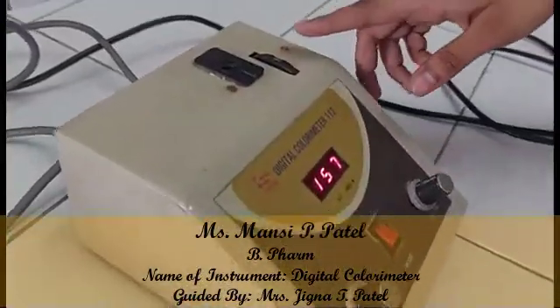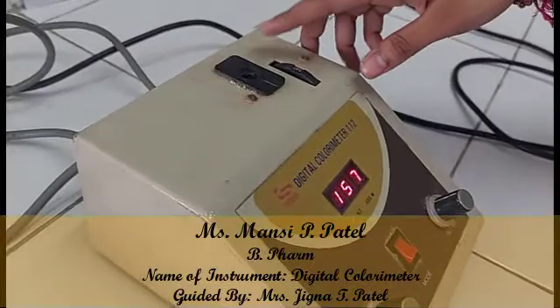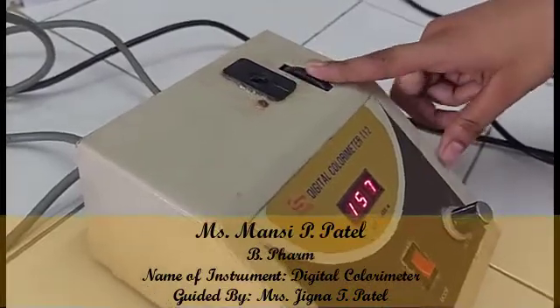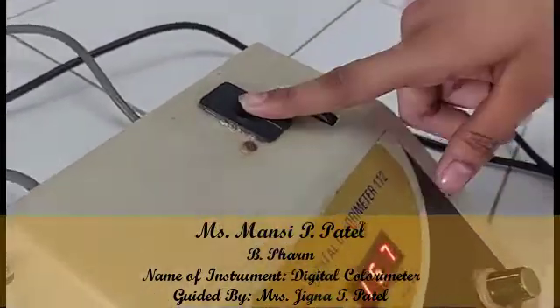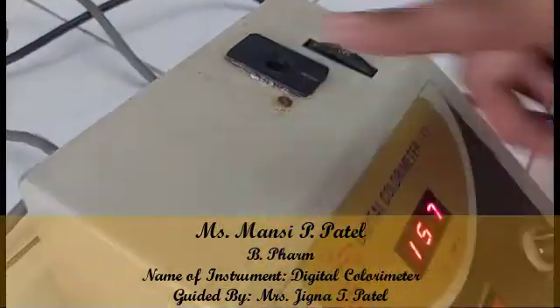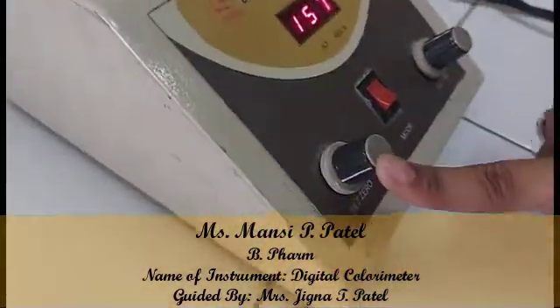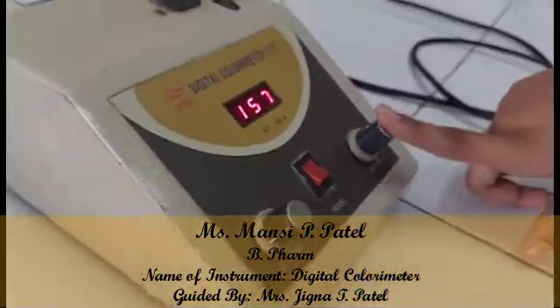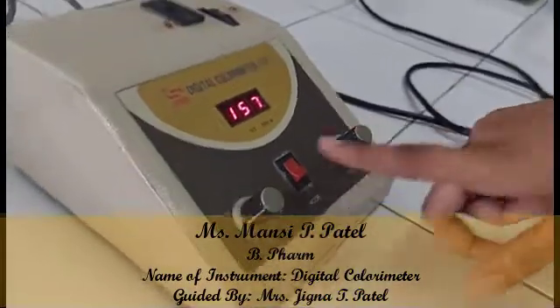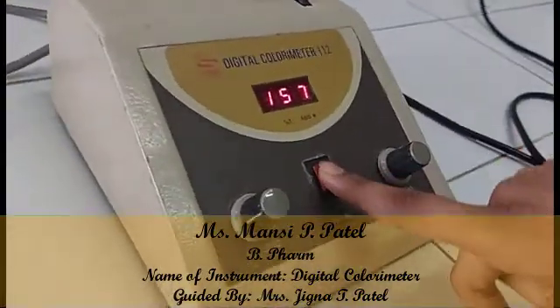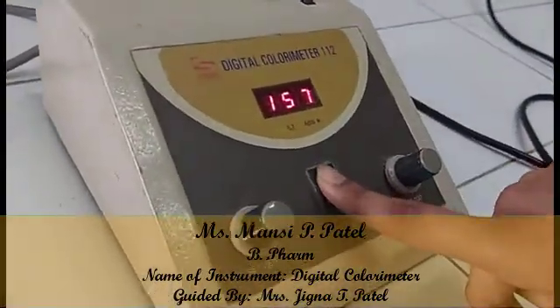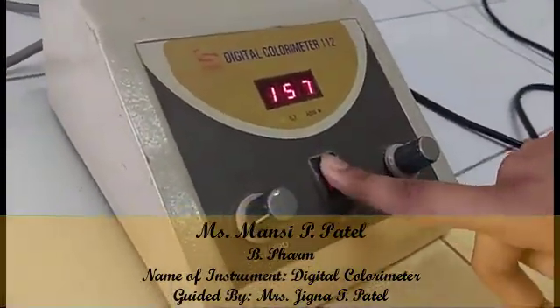Let's see the parts of this instrument. This is the rotating knob, this is the cuvette stand, this is the set 0 knob, this is the set 100 knob, and this is the percentage transmission and absorbance switch.